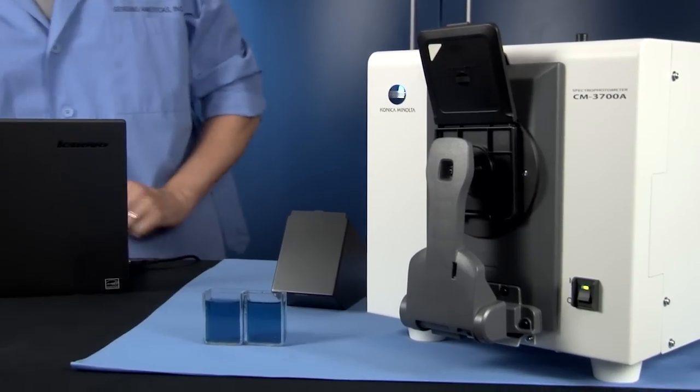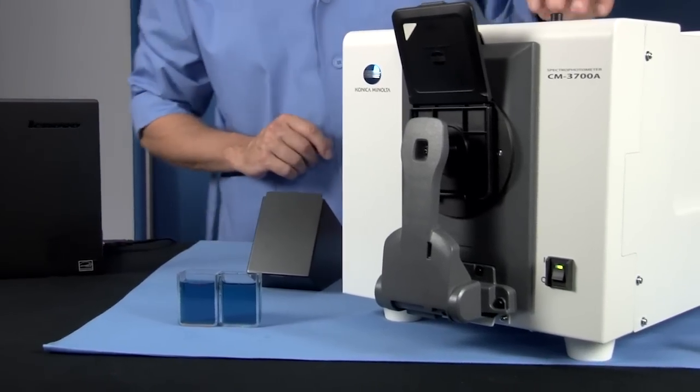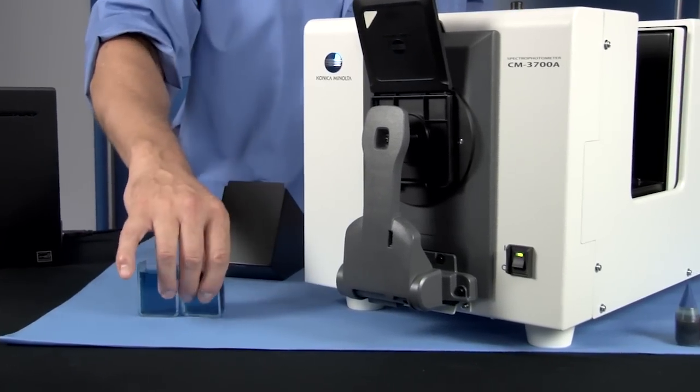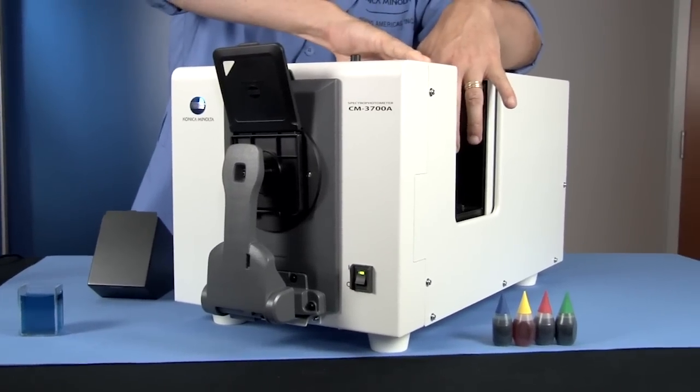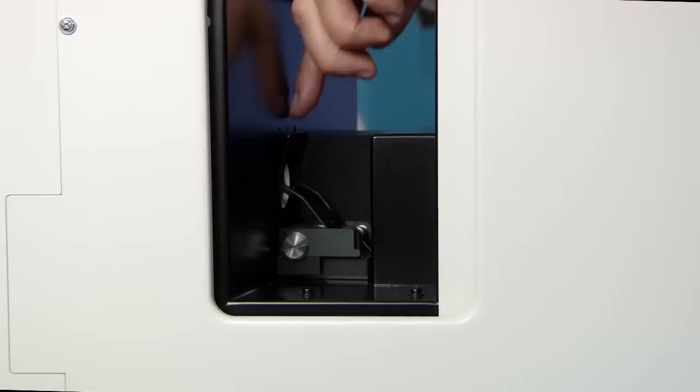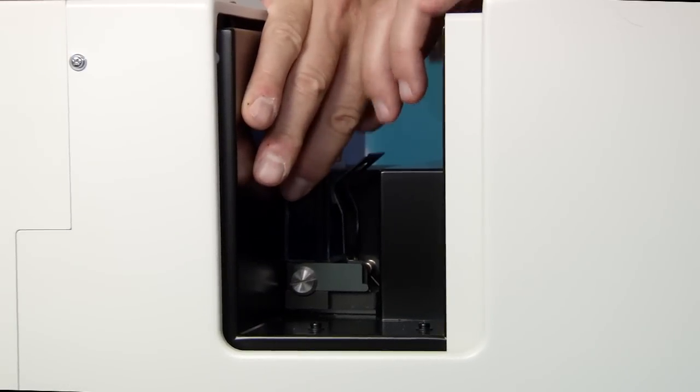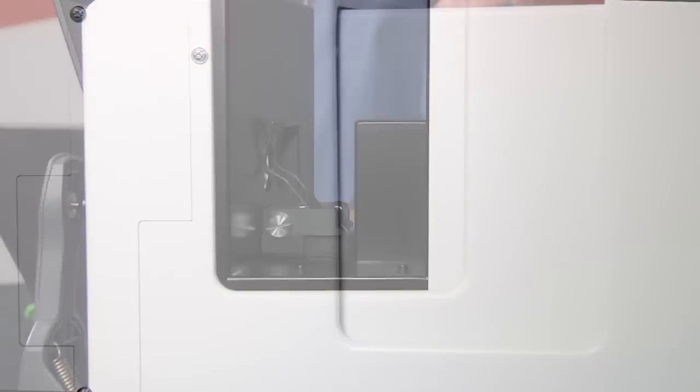The versatile CM3700A is built with comprehensive measurement functions. Measurements made in SCI or specular component included mode are unaffected by surface conditions, ideal for use in color formulation and computer color matching procedures.